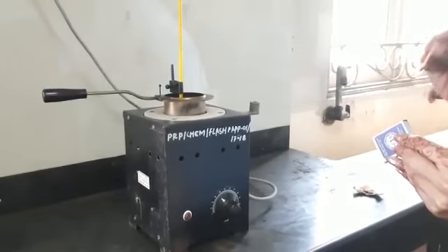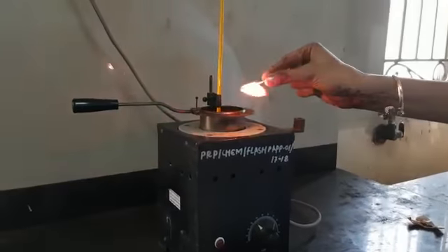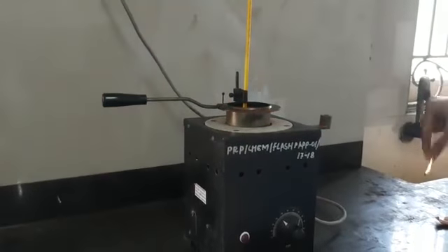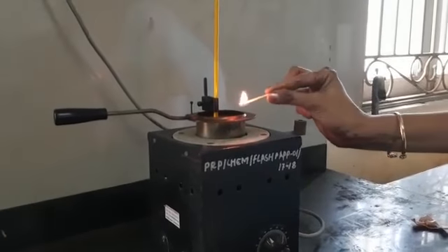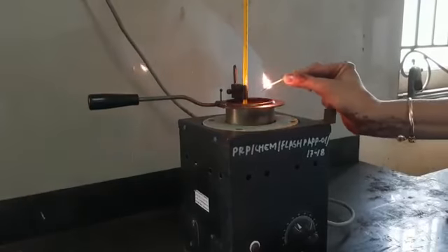Now the temperature is 40 degrees. We will check whether it catches fire, flash or not. No sufficient vapor, it is not catching a flash or fire. Now the temperature is 50 degrees. We will check whether it is catching flash and fire or not.